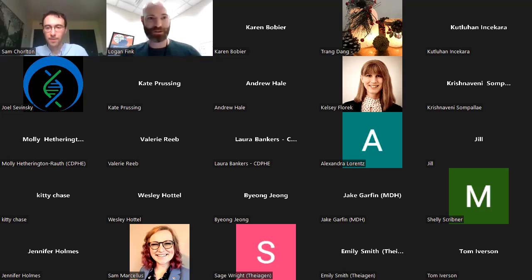It looks like there's another question in the chat. The sequence data you used are mostly ONT platform. Would Illumina sequences result in similar analysis performance, especially when dealing with metagenomic samples? Yes, is the short answer. As part of our BugSeq paper cited earlier, we applied it to the CAMI dataset, which is Illumina sequencing. It's the most commonly used benchmarking dataset for metagenomic classification, and it performed better than all other tools, I believe, in our benchmark on that dataset.